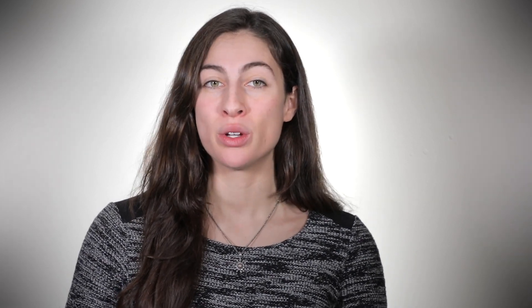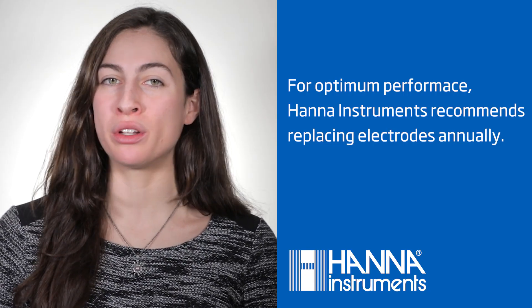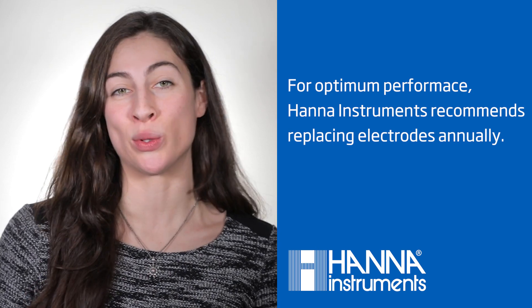The meter will show it recognizes the electrode and give you a probe condition. pH electrodes are considered a wearable part, so it's important to know your probe's condition so you'll be aware when it's time to replace it. For optimum performance, Hanna Instruments generally recommends you replace electrodes annually.